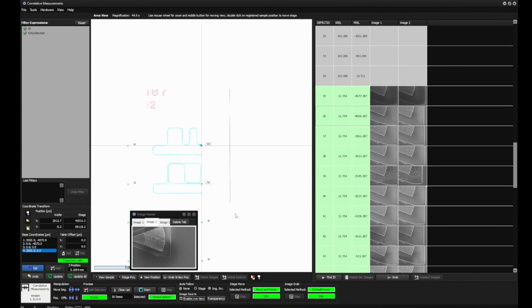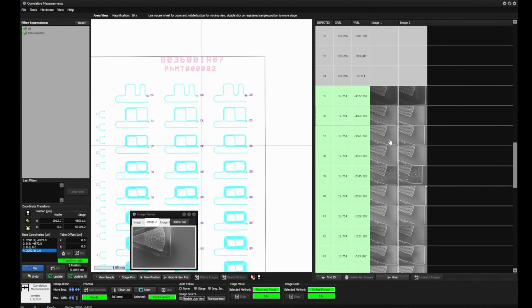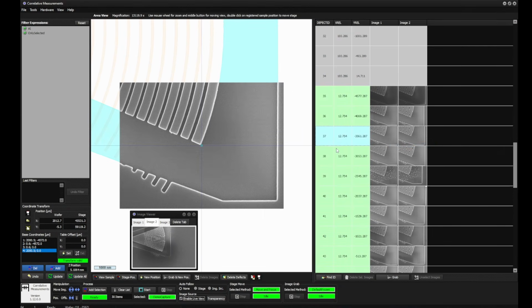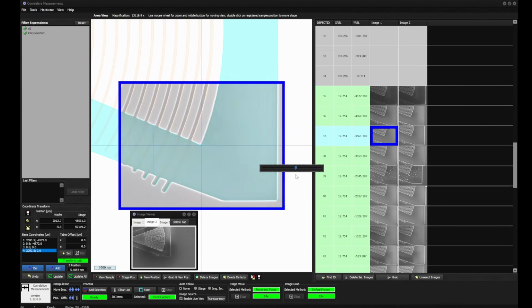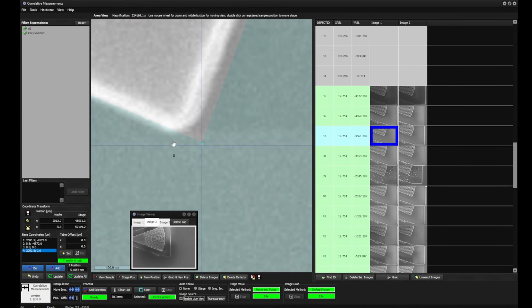If you just look at the right bar here, we have three different positions all over. So all three probably have different end positions. We can just check this here. Just for a first test, we disable this one, switch the transparency of this one down, and you can see that there is nearly no variation here.